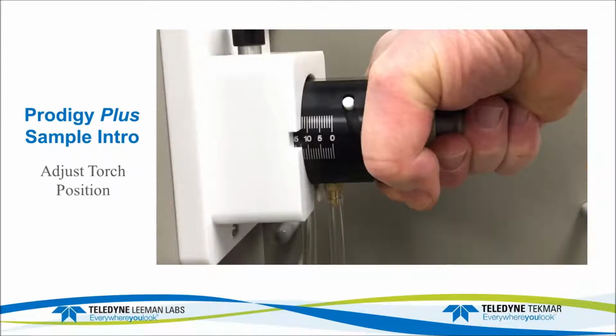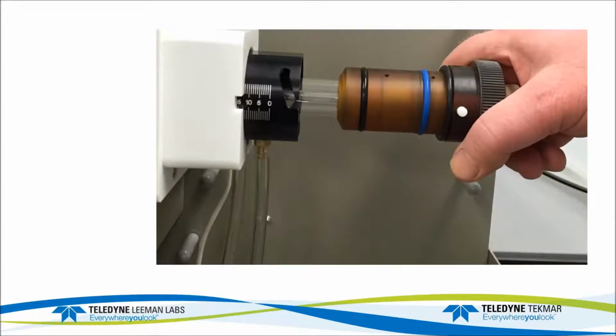And just an example of the scale. The scale that's shown there will allow people to remove and replace the torch in the exact same location. If you have high dissolved solids or different types of samples, this will help you place the torch in the optimum position for each one of those analyses. And when the torch is removed, you can see in between there these little gas ports.